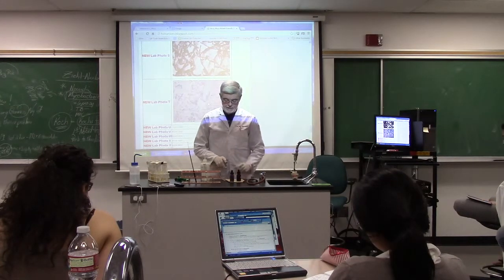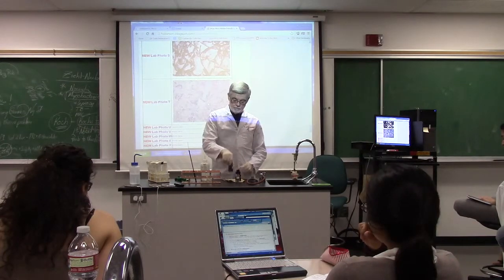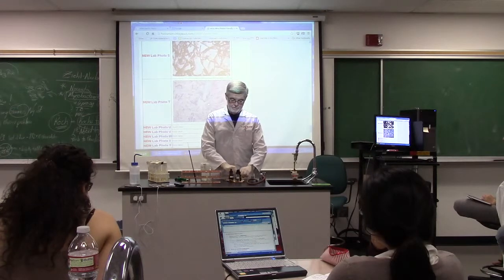Then lay it down there like that, and put your methylene blue on. And again, remember, since the previous step was water, you would like to put the methylene blue on, shake it off, and put it back on.